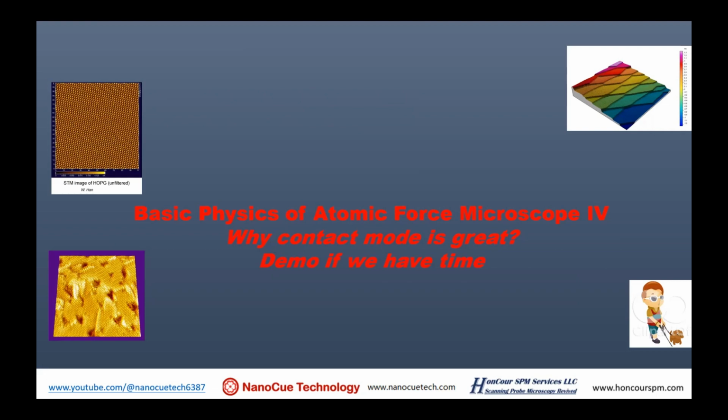You can have the greatest piano in the world and still be a very bad musician, and you could be the best musician and have a very bad piano, and it does not prevent you from being the best musician. So I try to say, you don't need the expensive AFM. If you know what you're doing, you don't need it. You can have great things happen with your existing old instrument. Okay.